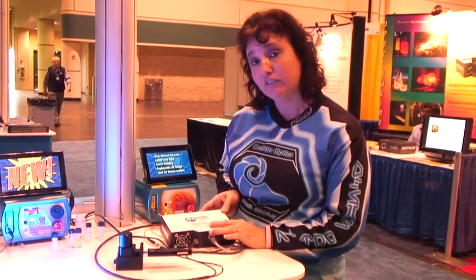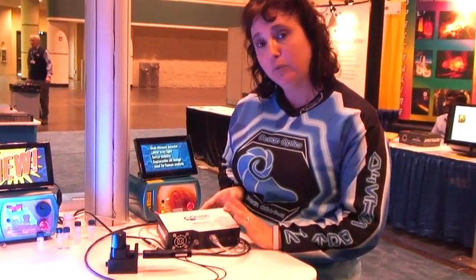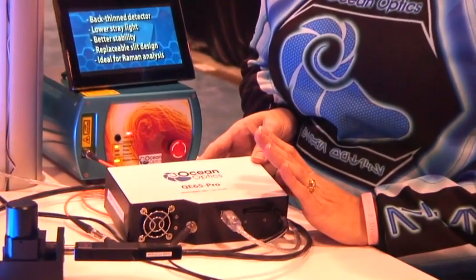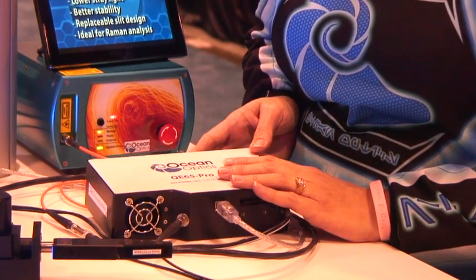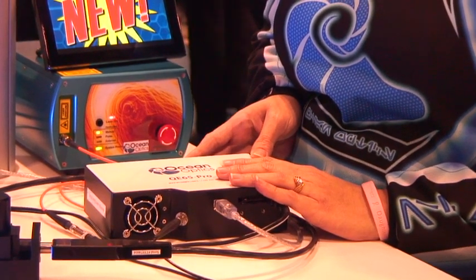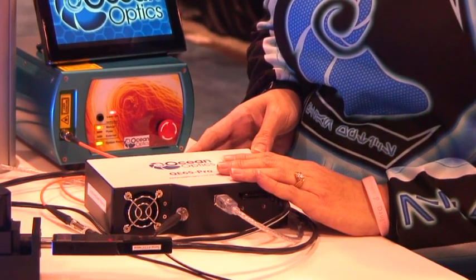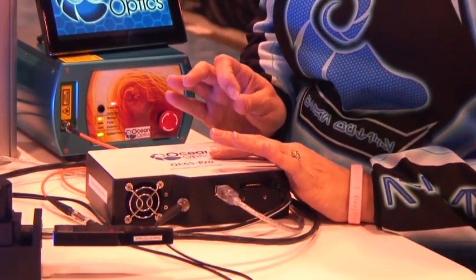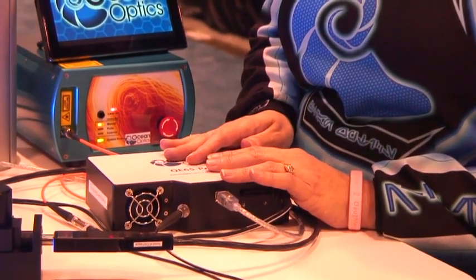This is the next generation of the QE65000, and we have made a great spectrometer even better. We have increased the thermal stability of this bench. We have several new ultra-low stray light gratings available, and we have new mirror options. All of this can be done to customize and tailor this spectrometer to your specific application.